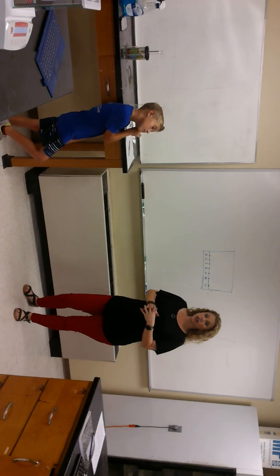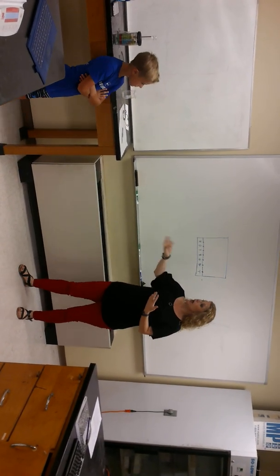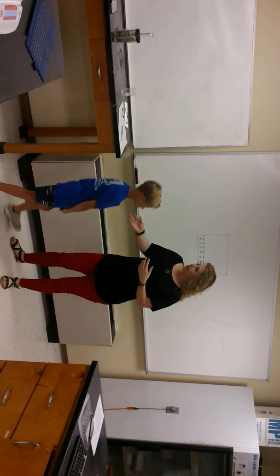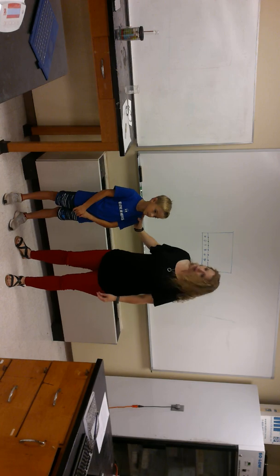Our second lab is on paper chromatography. So we have a problem that we need to address. I have a friend, and my friend is allergic to yellow dye number 5. That's kind of sad, isn't it? That means that any food that has yellow dye number 5 in it, he can't eat, okay?